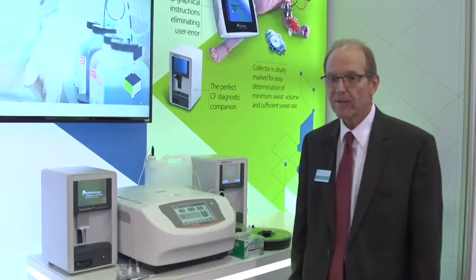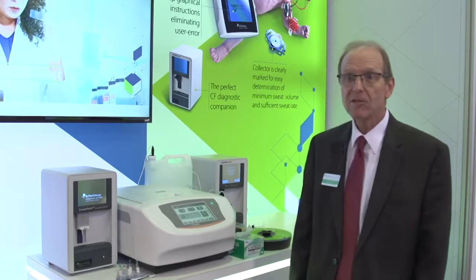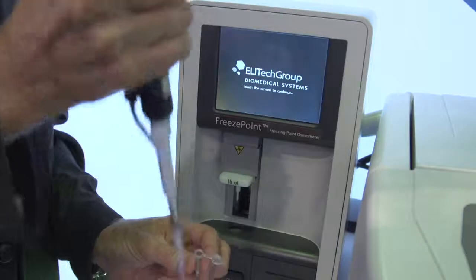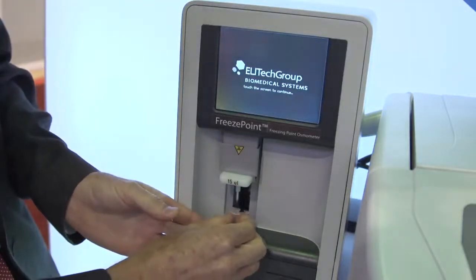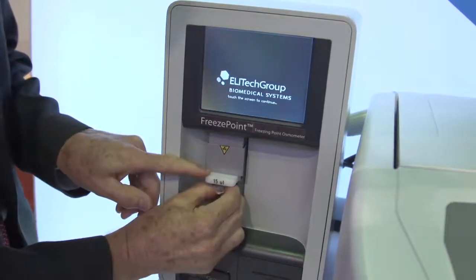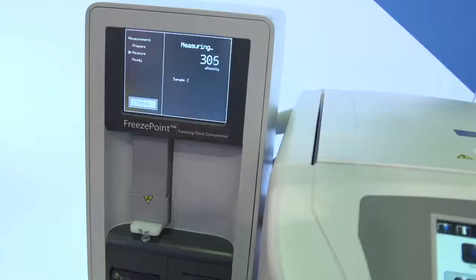The freeze point osmometer requires a 15 microliter sample size. We pipette a 15 microliter sample into a little cuvette, attach that to the osmometer, and then run the instrument. Twenty seconds later, we get the result.